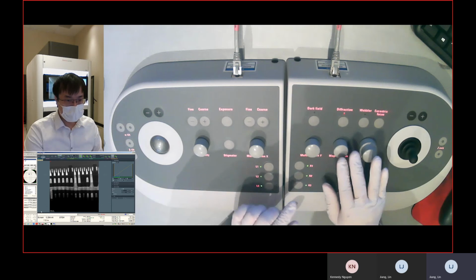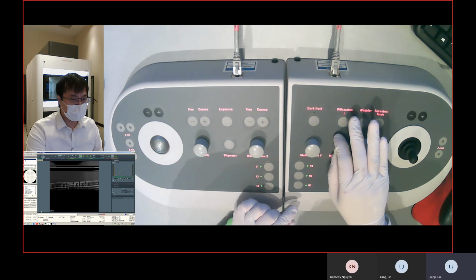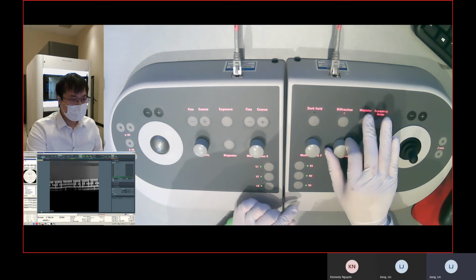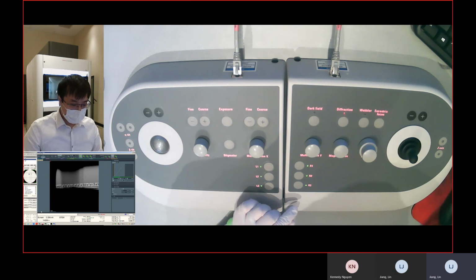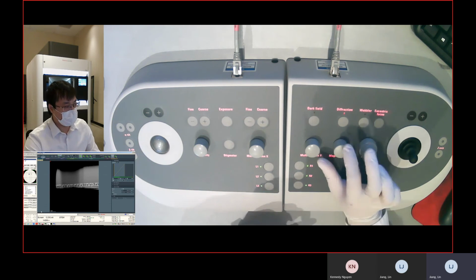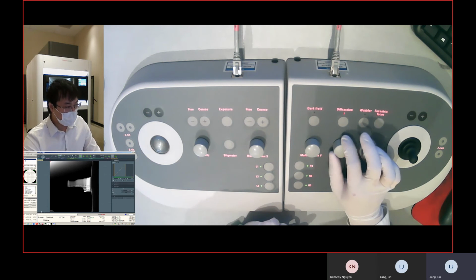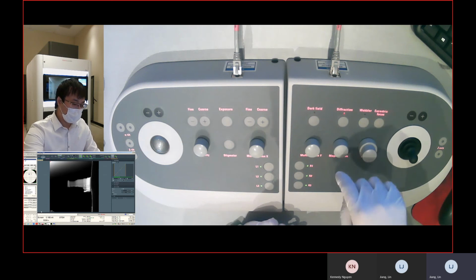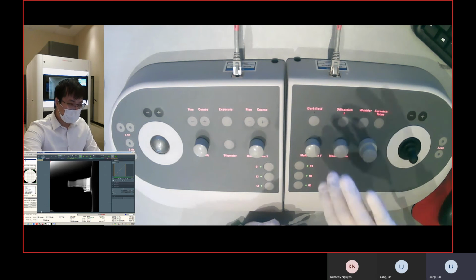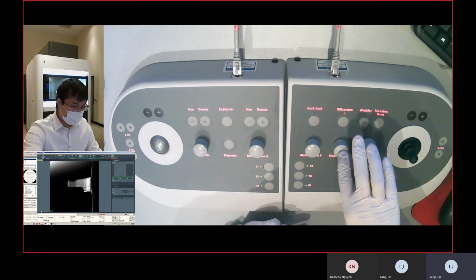And then we have the magnification knob here. You can change the magnification, zoom in or zoom out. The smallest magnification we can do in the normal STEM mode is 5,000. If you turn counterclockwise, it's zoom out. If you turn clockwise, it's zoom in.